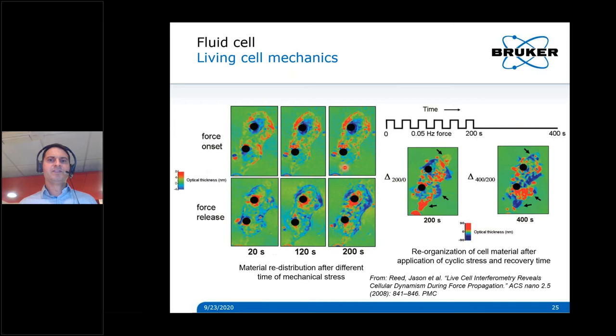And then from the start and from the end, you can deduce and subtract images to see where the density has changed. What you see is definitively some rearrangements, especially around the beads, telling us that this cell was able to reorganize organelles and stress fibers in order to bring more resistance underneath the bead. So it's pretty interesting to get such a science where we use light to travel through and gain information about local density.